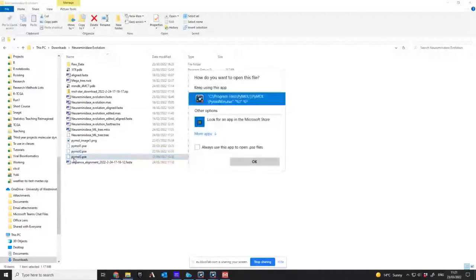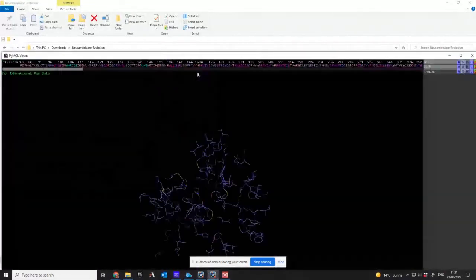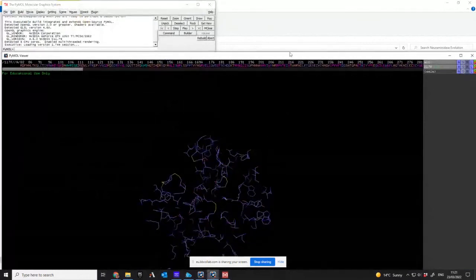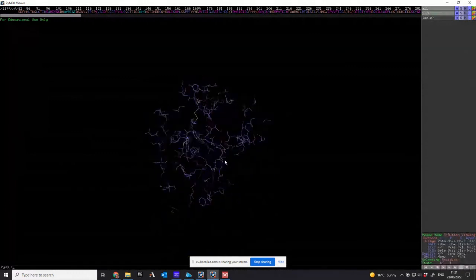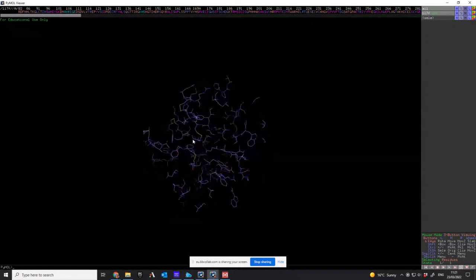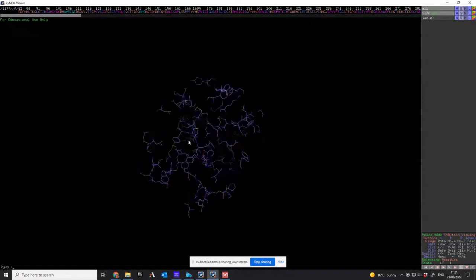So the last thing I decided to do was just create an image of those conserved parts of the protein and then get rid of the cartoon. So this shows you this central core which has been preserved in evolution.